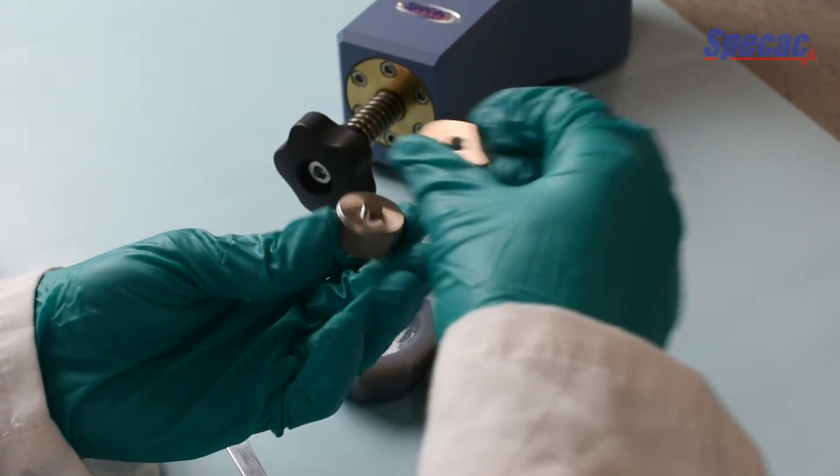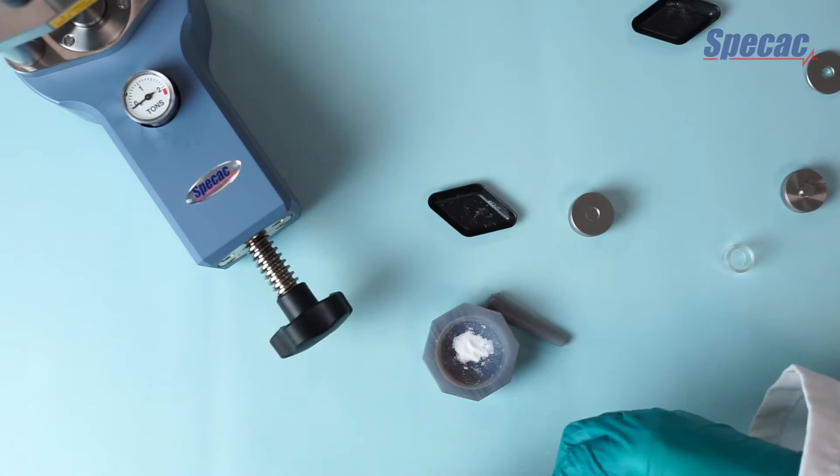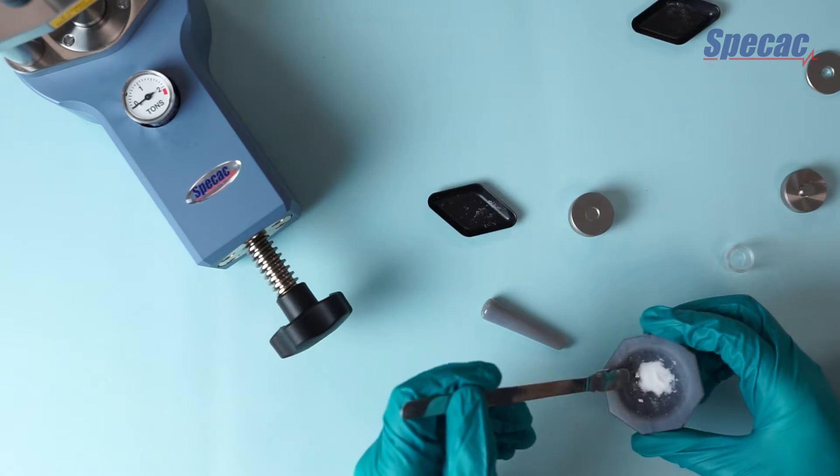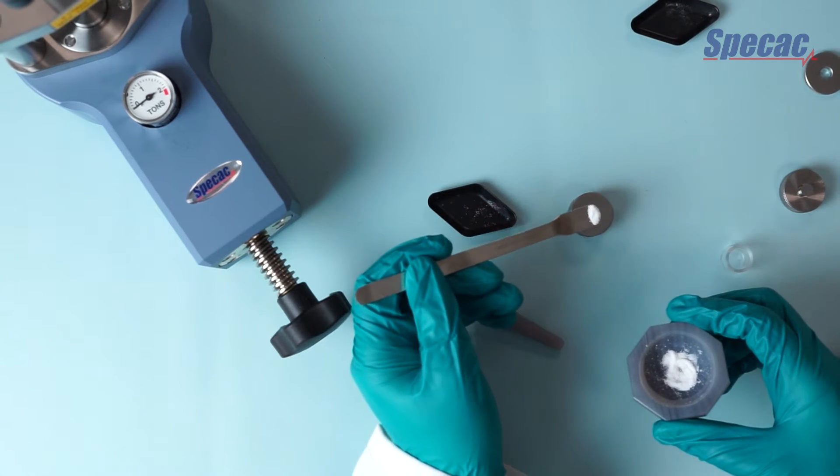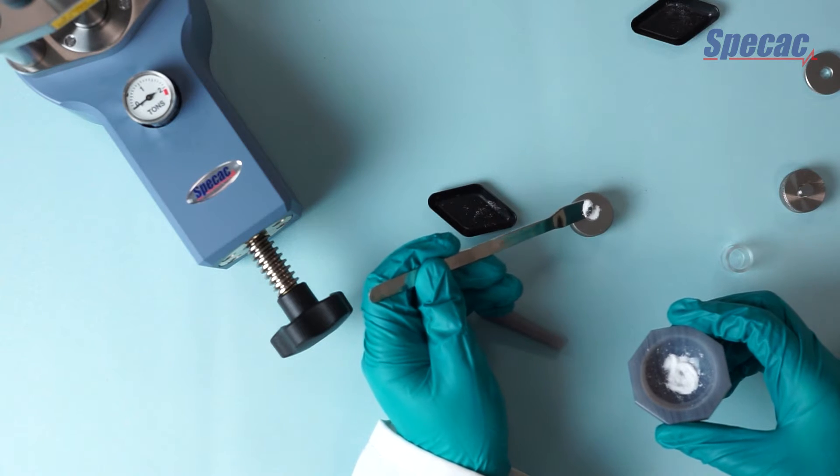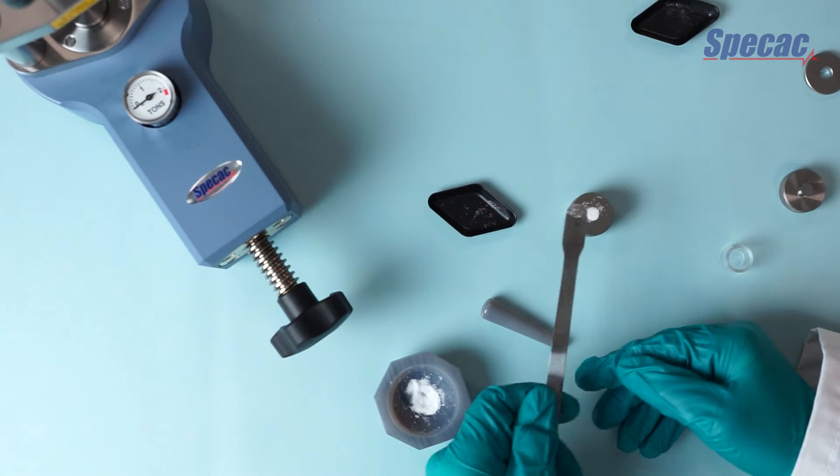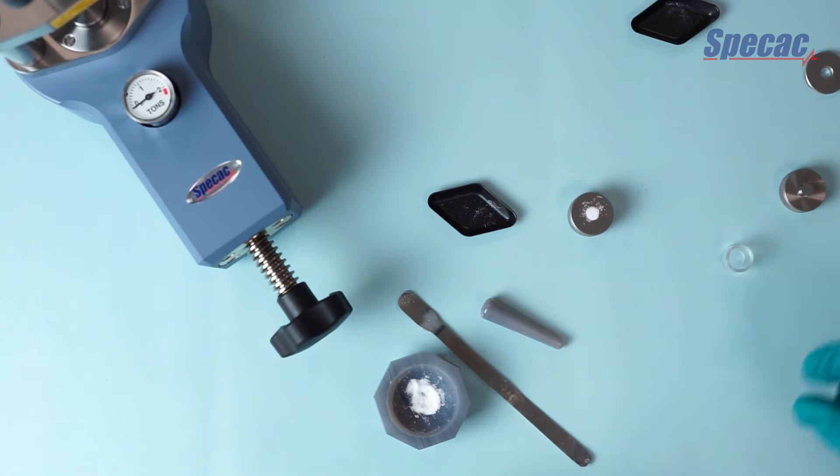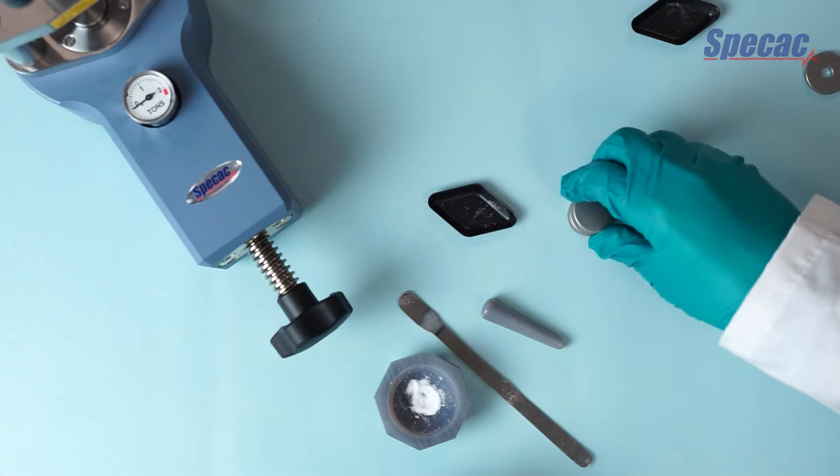So we place the ring holder on the bottom anvil and then we use a spatula to transfer a small amount of sample onto the top of the ring holder. We need enough just to fill up the recess there. We can smooth it down using the spatula and wipe away any excess material, and then gently rest the top anvil in place.